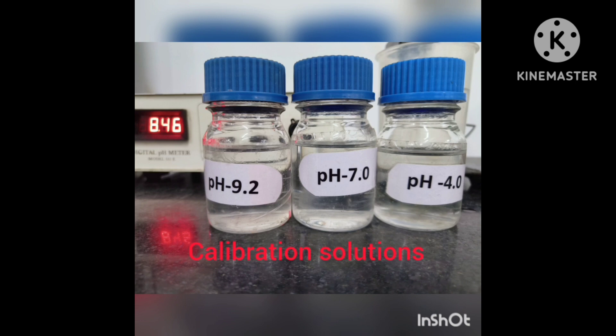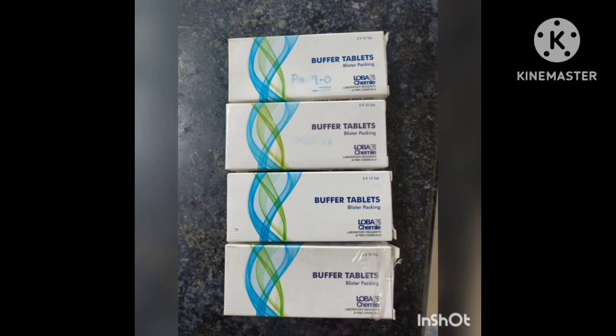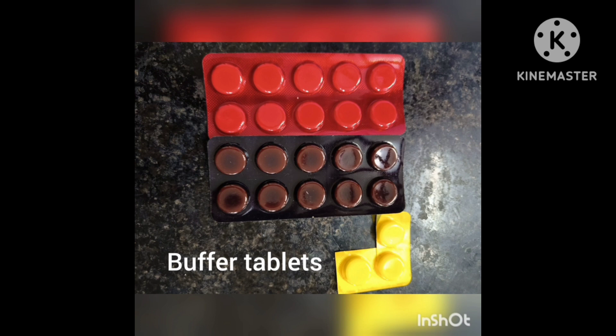pH meters need to be calibrated periodically to ensure that they are giving accurate readings. This is typically done using a solution of known pH, which is called a calibration solution. For this calibration or for making the calibration solution, we use buffer tablets of pH 9, 7, or 4.